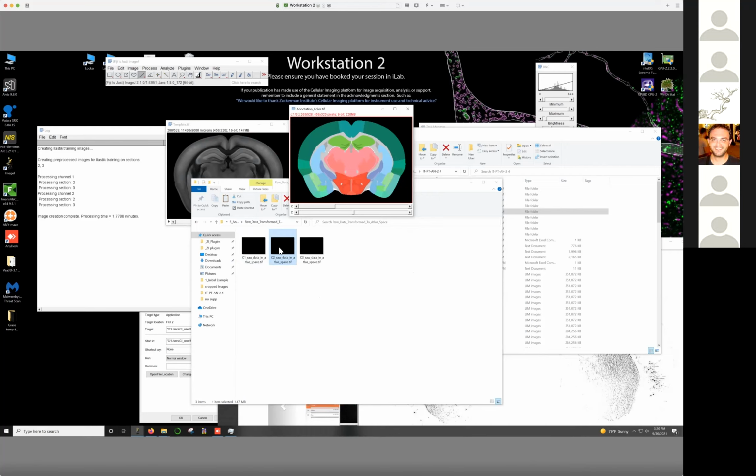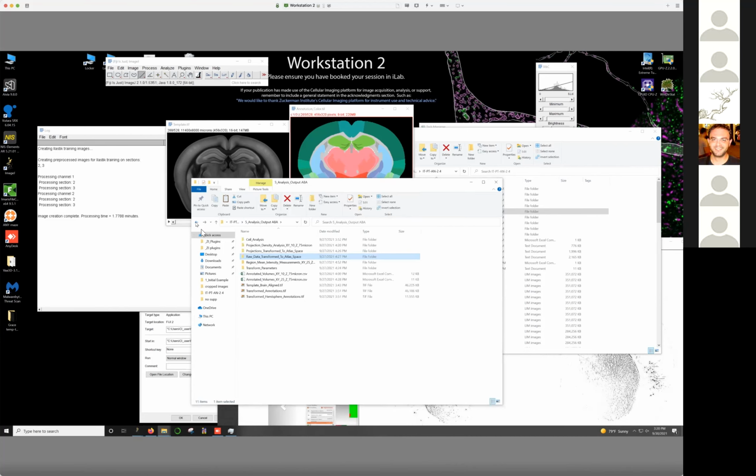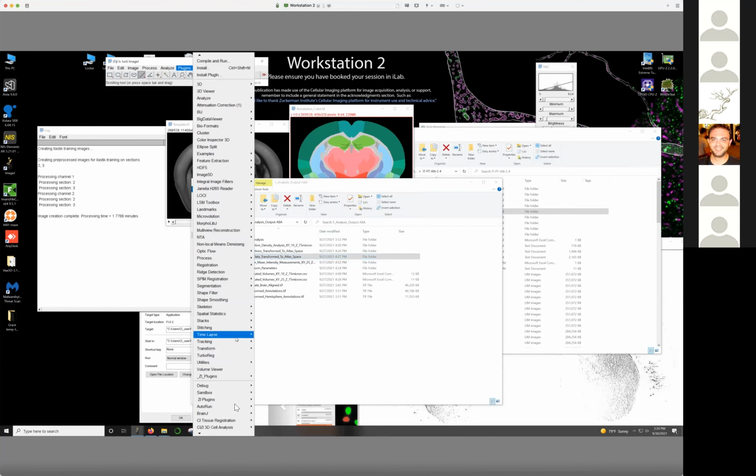And this is not necessarily so trivial to do. But I've updated the pipeline to include this for doing volume measurements and measurements of probes and things like that. These extra tools are available just underneath other tools here. There's a couple of things in here. If you need to use another data set, like light sheet data from Imaris or something like that, you can import data this way using these tools.